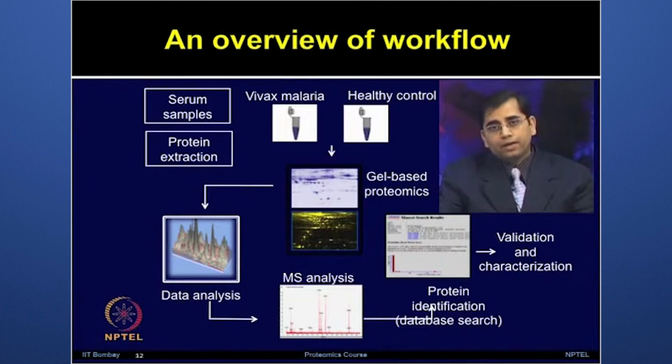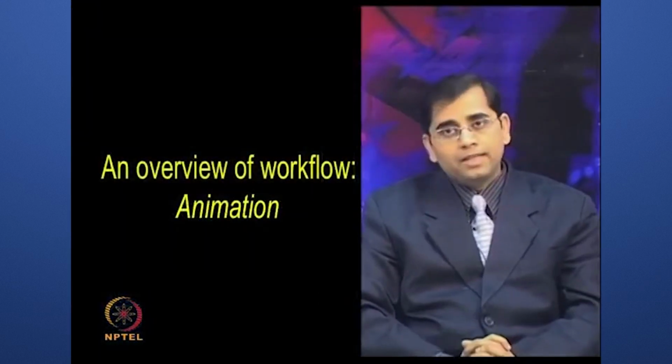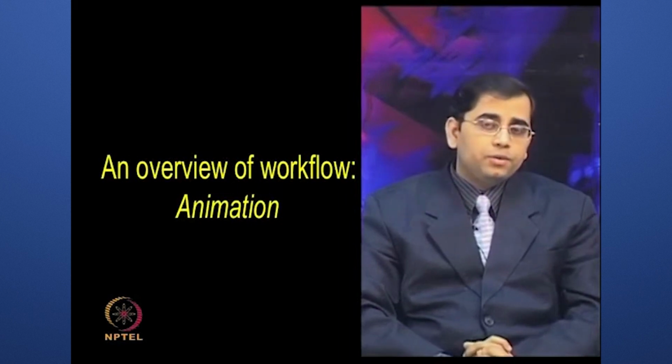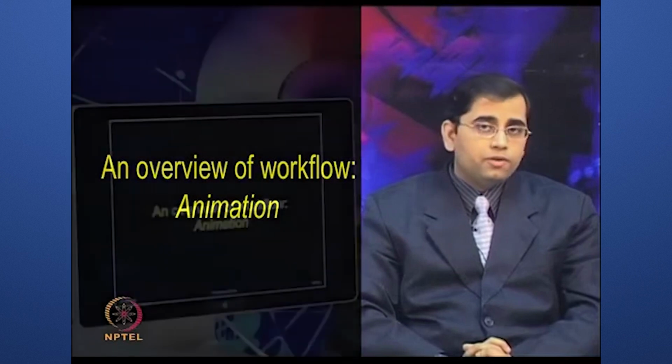Further, we validated a few targets and analyzed the data for various types of pathways which could be involved in such a disease. Before we move to details of the various experiments performed in this study, let me show you this animation to give you an overview of the workflow followed in this experiment.